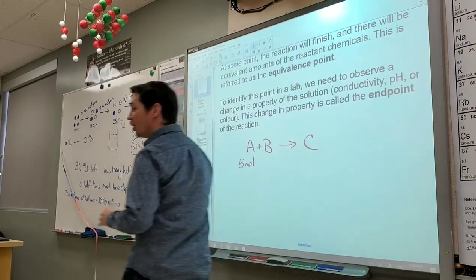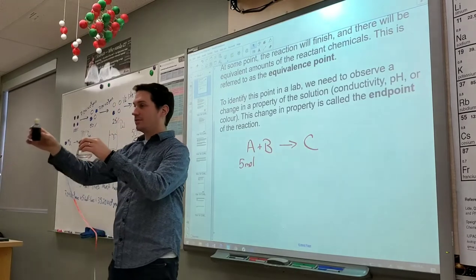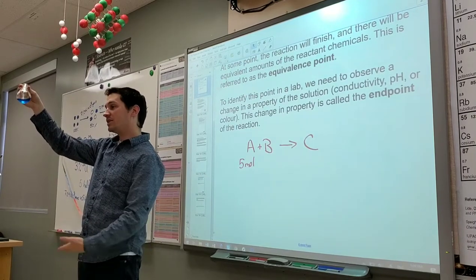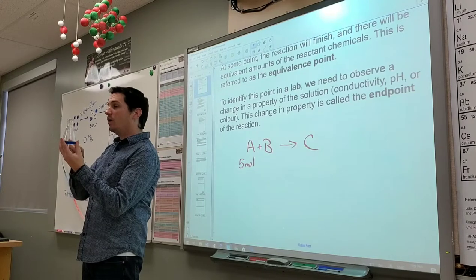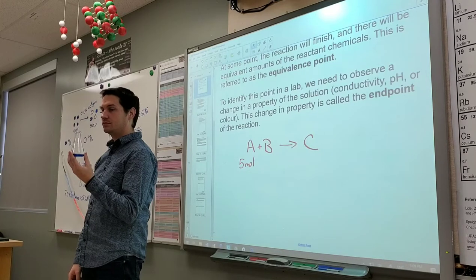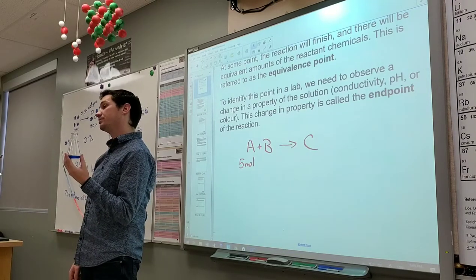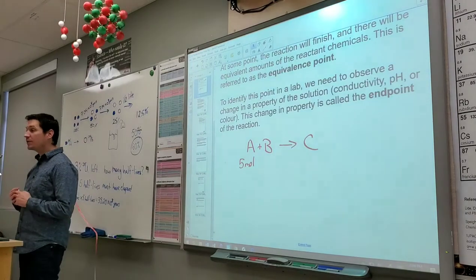So in here, I've got a base. And you know how I know it's a base? Bromothymol blue stays blue in basic solutions. When will this solution be neutral? What color will this solution turn at a pH of 7? It'll be green, right? It'll be equal parts blue and yellow, so it'll be green. Perfect.